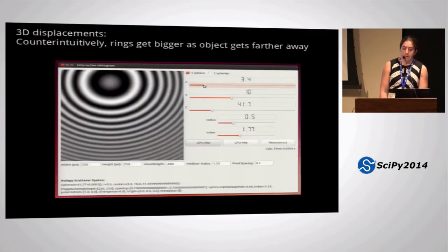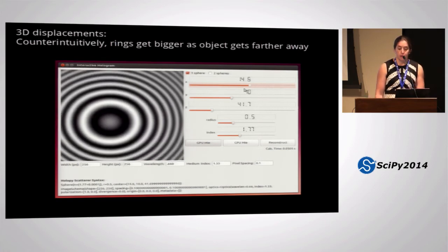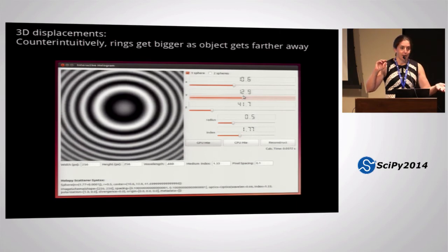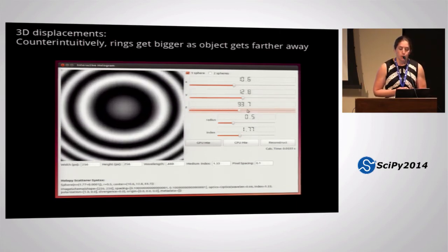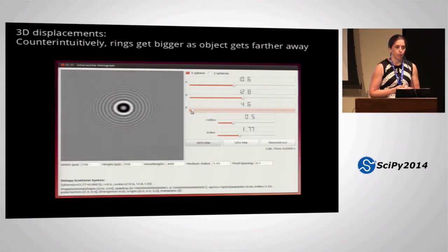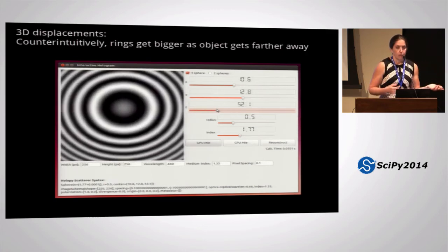So this is how it works. You drag around the different parameters, and you can see here, a new learner might learn that we have a little bit of a quirky definition of where x and y axes are, but you can quickly pick that up if you slide those around. You can also learn how the hologram changes when you move the particle farther away. You see that the rings get bigger, which is in contradiction to how we usually see things in perspective in our macroscopic world. This is because you can think of a flashlight with the beam expanding before it hits the detector, so there's this cone of light that expands. So you need to get used to that as a new holographer.